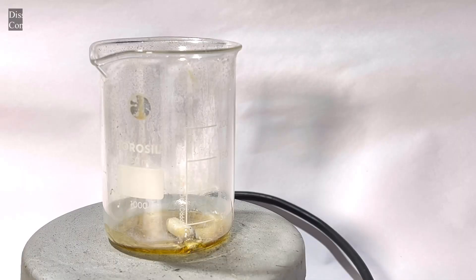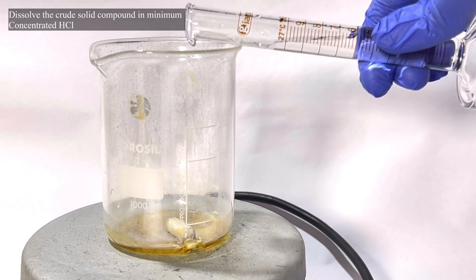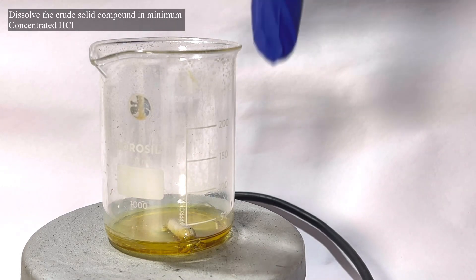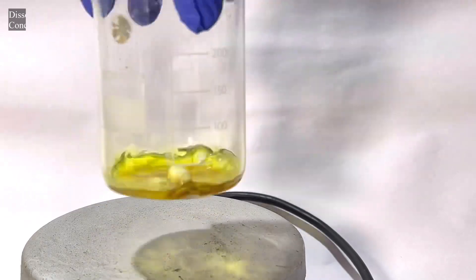The solid tellurium tetrachloride was dissolved in a minimum amount of concentrated 35% hydrochloric acid. I used around 15 to 20 milliliters.